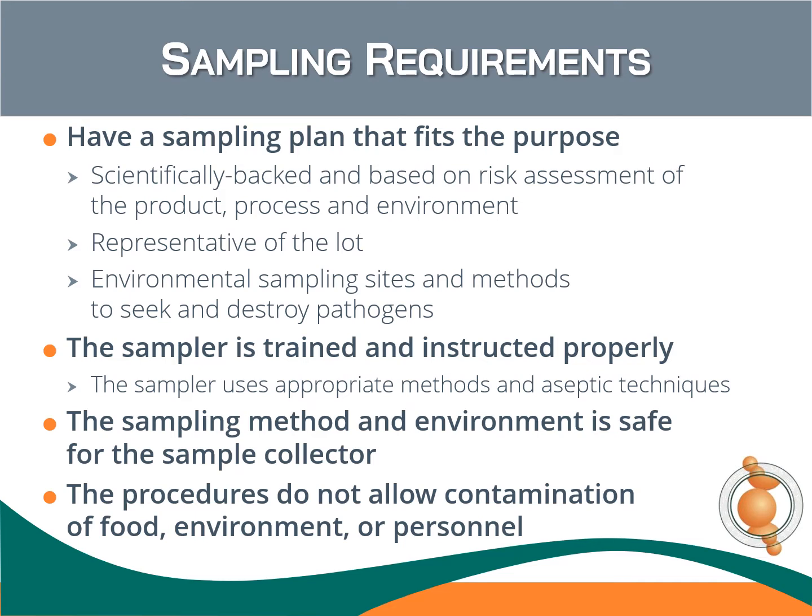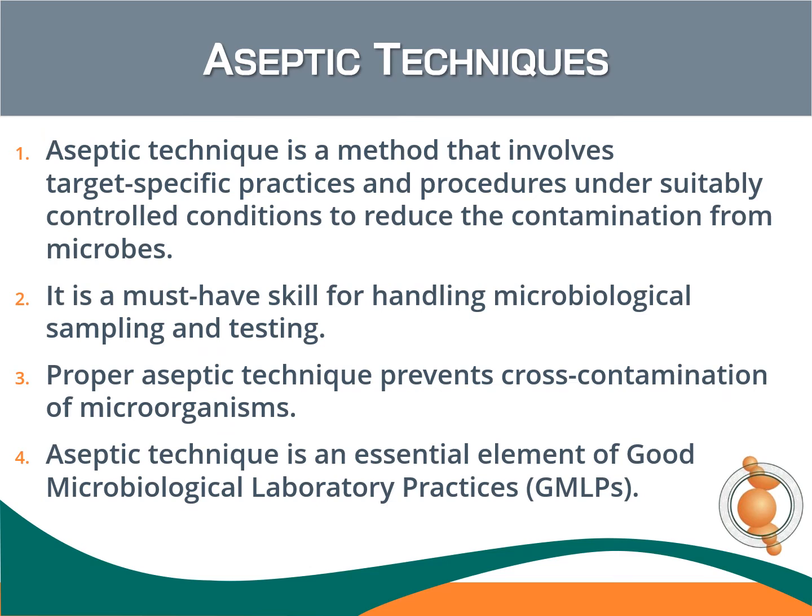Third, the sampling method and environment must be safe for the sample collector. And last, the sampling procedures must not allow contamination of the food, environment, or personnel.